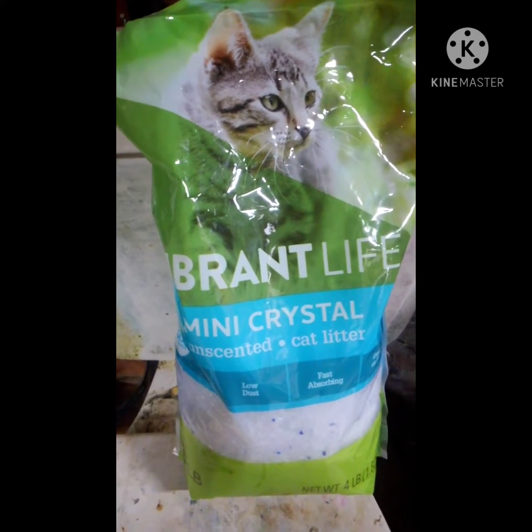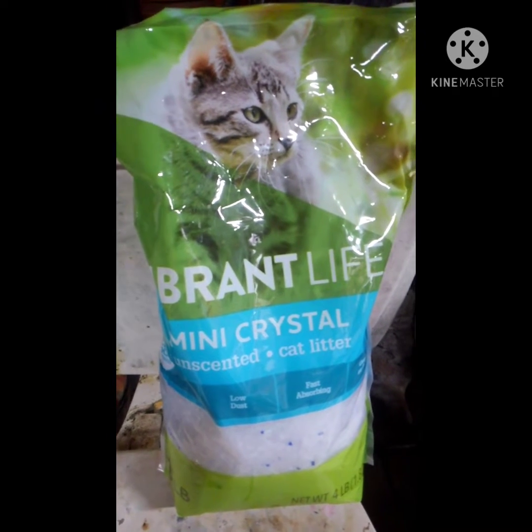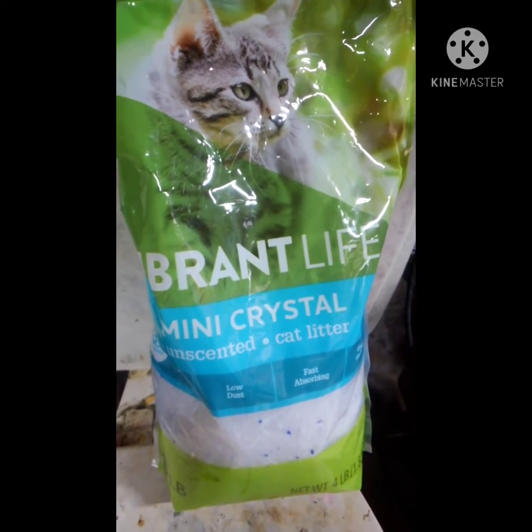What's up YouTubers and YouTubettes? Today we're going to be preparing Silica Gel G, which is used for making TLC plates for flash chromatography.